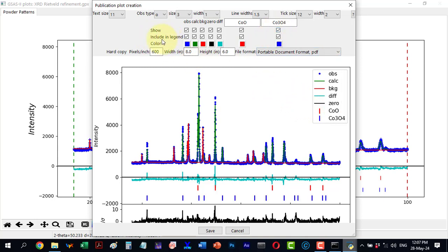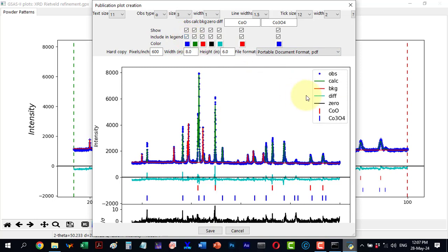Similarly I can decide what to include in the legend, such as the observe pattern. Unchecking it updates the legend but keeps the plot the same.